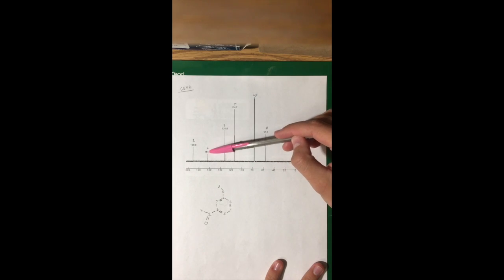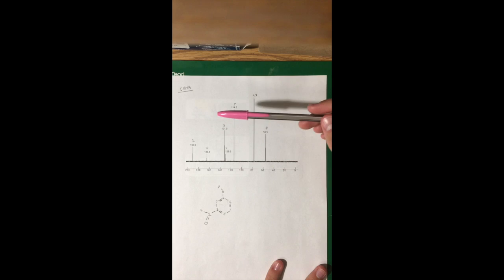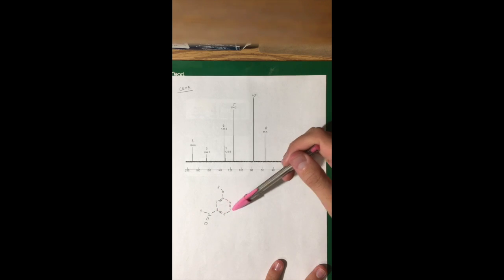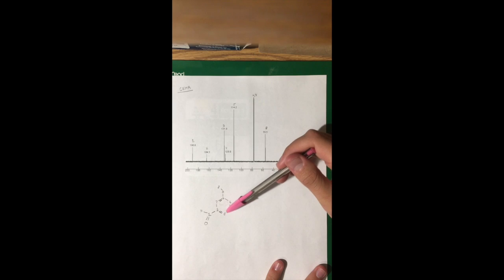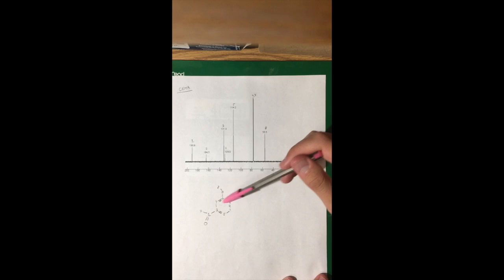Next, the 2 position carbon, around here at 164.5, was found to be the aromatic region, so right off here. 3 and 4 are very close together, also off the aromatic. 5, at 114.2, is aromatic region again, which we see right here. And then 6 and 7 were correlated together right here, which were also off the aromatic. This correlated to 6 and 7 because it is very thick and it is the highest one on the graph.